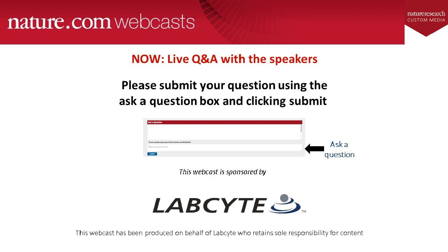In the samples that we had, we did not see any sample or strain dropout from the reduction of library volume size, especially with the 16S process that is highly amplification based. Even at half a nanogram for our samples, that was plenty of DNA. We weren't hitting the limits of complexity there. Obviously, if you miniaturize further, it's possible to lose samples, but we would like to emphasize using the rarefaction curve as a guide to figuring out how much.